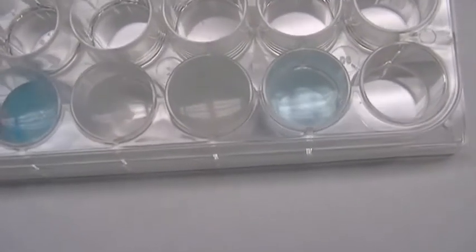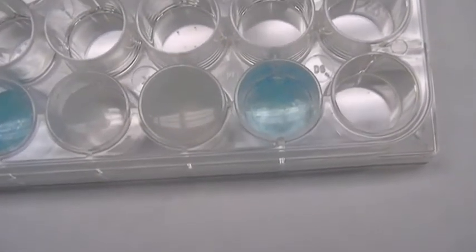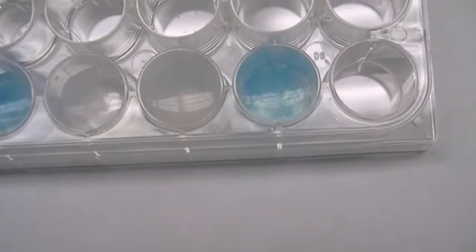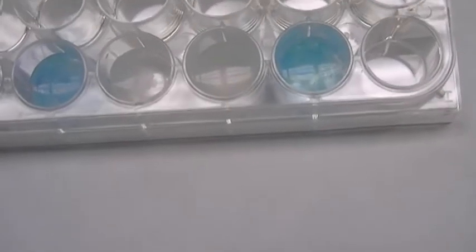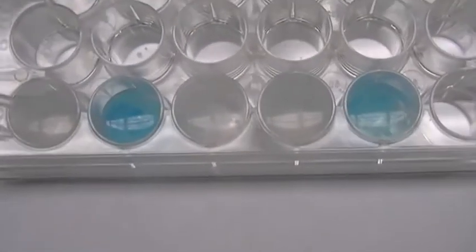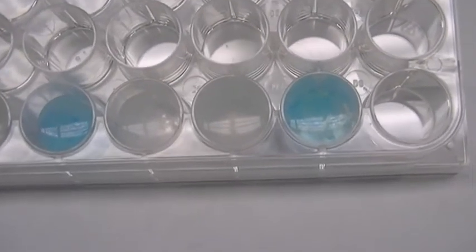Again, you get that cloudy white reaction going on. And then again here you get that dark blue color that forms when you add it to the copper nitrate along with 1 drop of silver nitrate. And then we can add some more to our copper and see that it is turning a darker blue. Very colorful complex ion formation. And then the zinc is forming a white cloudy precipitate. And then the silver is also forming a white precipitate.